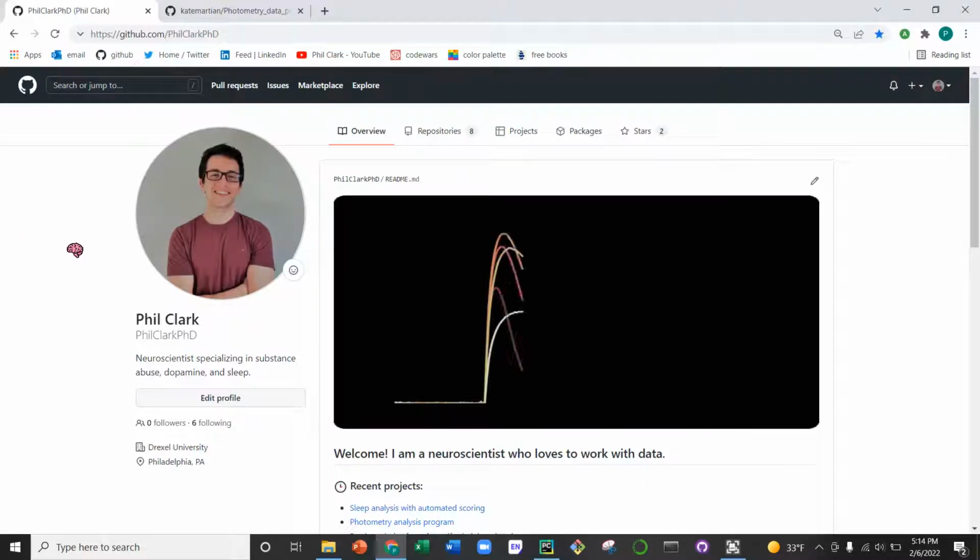Hey everyone. Today I wanted to make a quick video on this photometry analysis program that I've been working on. If you do fiber photometry, then you know that the hardest step is really the analysis part. The surgeries and the recordings are pretty straightforward, but the analysis can be really difficult, especially depending on what system you have. So I have a Neurophotometrics system, and there's no built-in analysis software that comes with that. So I've had to kind of scour the web to find what's available.